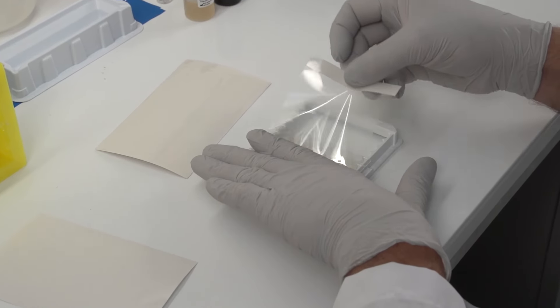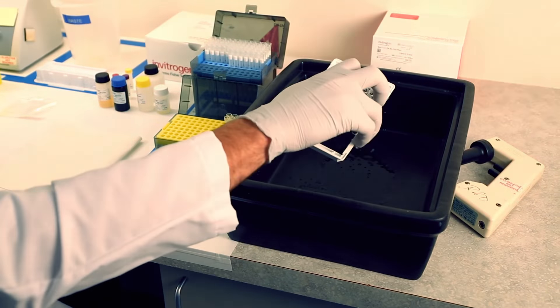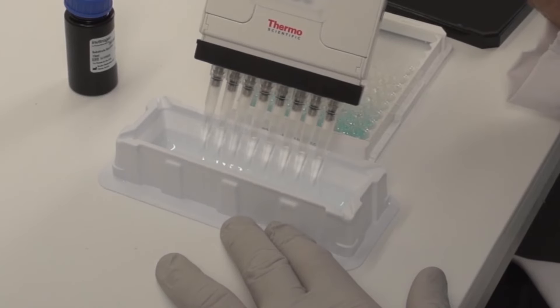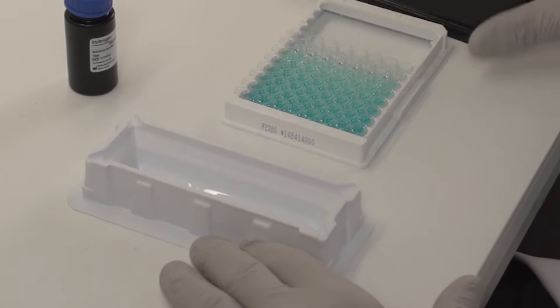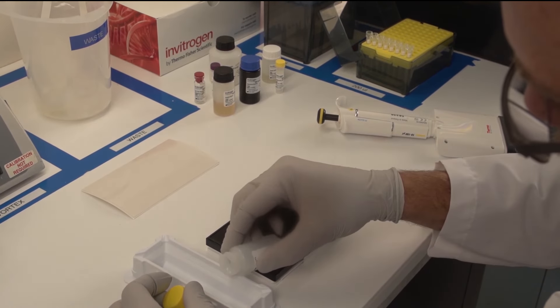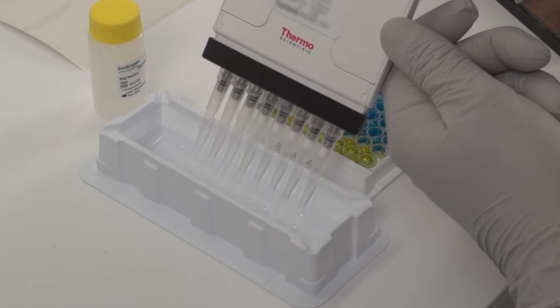Incubate the plate as recommended in the protocol. Wash the plate as previously described to remove any excess enzyme. Add the chromogenic substrate — the intensity of the color developed is proportional to the amount of protein present in the sample. Incubate the plate at room temperature in the dark for 30 minutes. To stop the enzymatic reaction, add stop solution. The solution will turn yellow.